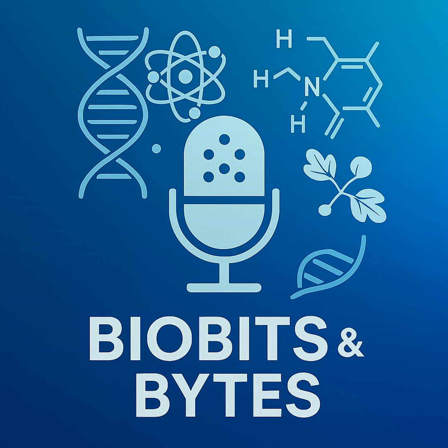Now we hear these names, Southern, Northern, Western blotting. Sounds a bit like a joke almost. Can you walk us through each one? What molecule does it look at? What's it used for? Let's start with Southern. Right, Southern blotting. It's named after Edwin Southern, the scientist who developed it. And this one is all about DNA. Its purpose is analyzing and identifying specific DNA sequences.